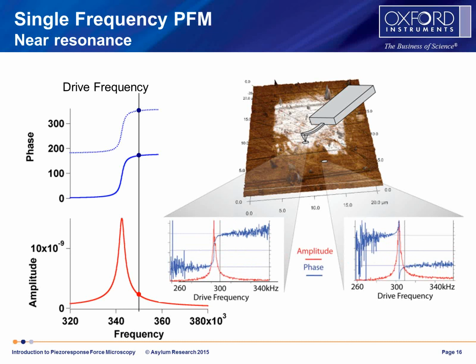As I mentioned in the previous slide, you can see the relatively poor signal to noise away from resonance. It improves as we go through resonance, and then it gets bad again. As we go over the up and down domain, you also see the phase shift. If we call that 0, the phase shift over here over the down domain is 180 degrees different from the other domain, as it is above resonance as well.